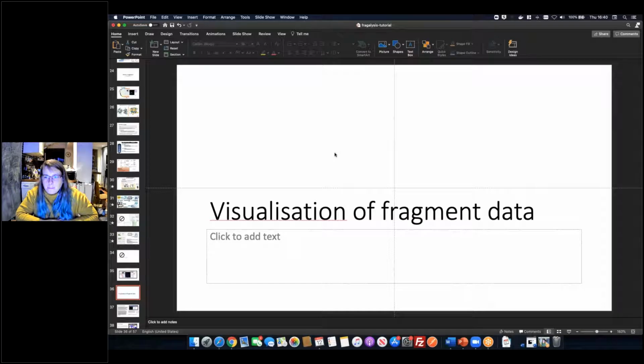So just to be clear, all of your fragments are reagents in the Enamine REAL database, are they? A majority of them, yes. So we have a few different fragment libraries for different purposes, but the main one is the DSI-Poised library, which was developed in collaboration with Enamine to align to their REAL database and to make sure that we can elaborate them very easily with their building blocks.